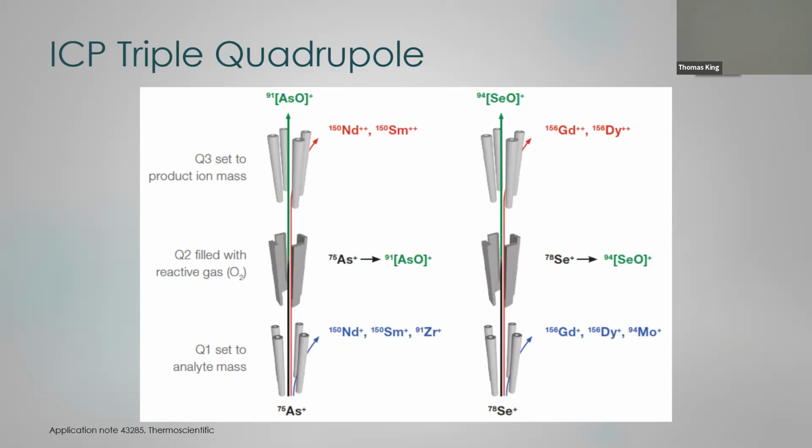And it's also used for selenium, but selenium is not that toxic, so I'm not really concerned about selenium. It's more for use for arsenic.